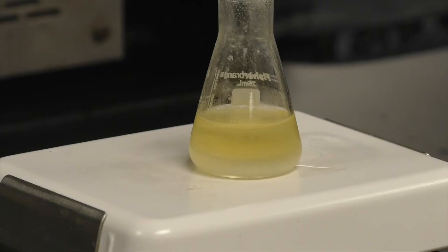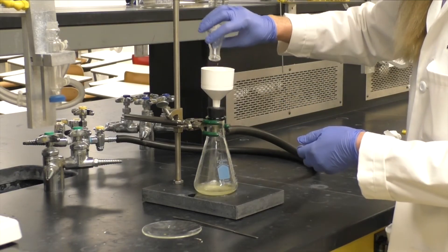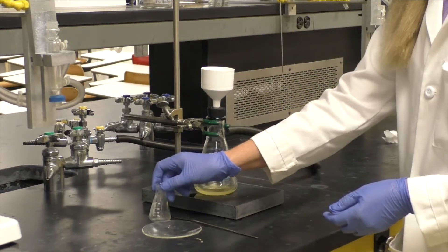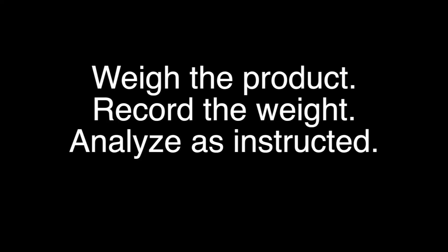During this time, pre-weigh your filter paper and watch glass. Suction filter the final product until dry. Weigh the product, record the mass, and further analyze your purified crystals as instructed.